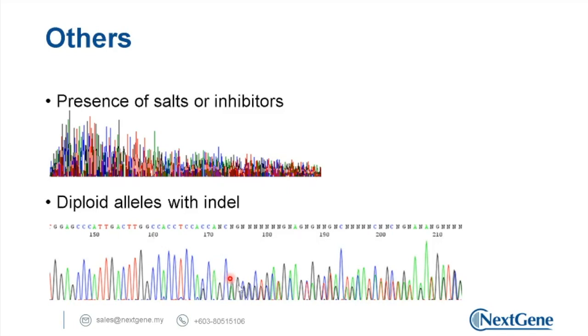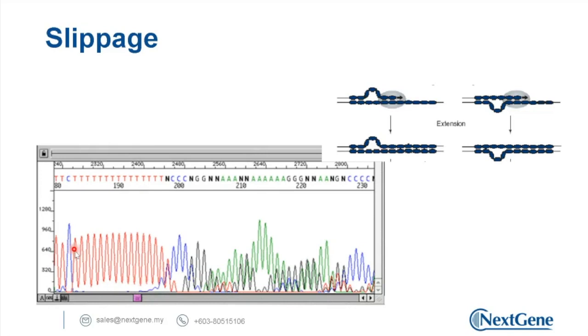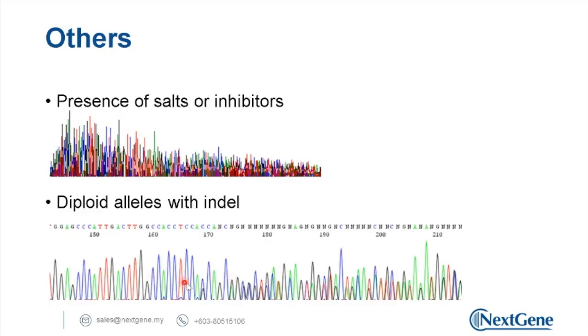And in this other case, everything is fine with the signal in the beginning. And then up to a point again, we have overlapping sequences. This is different from the case that we looked at earlier, where we have poly T, poly A, poly G, or repeats, like a long stretch of repeats, AT, AT, AT, and so forth. We didn't detect any of this kind of arrangement over here, so that's why this is a different case.